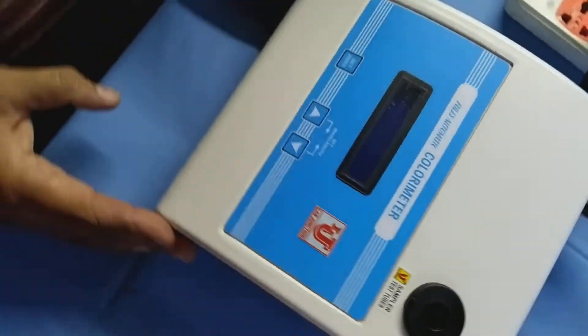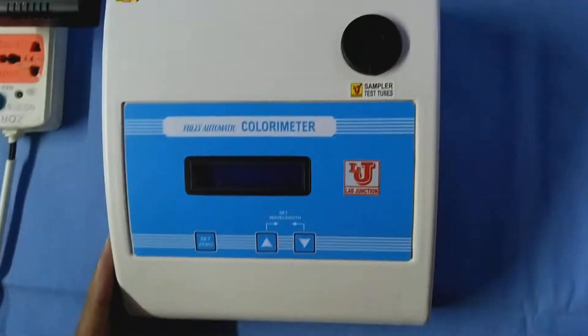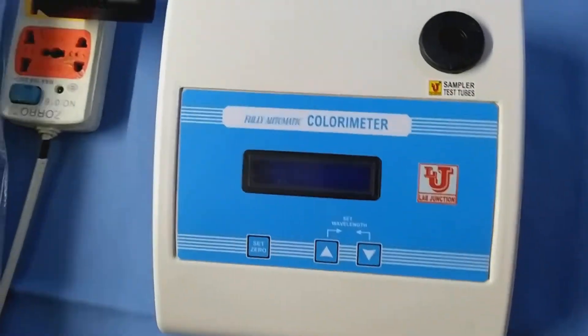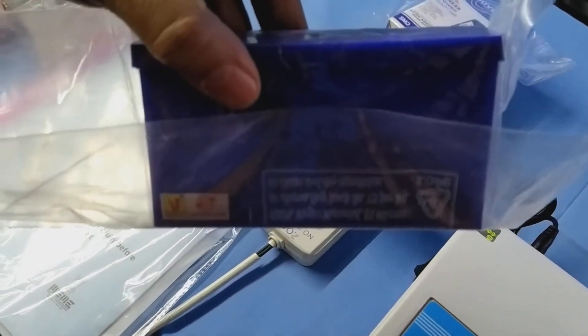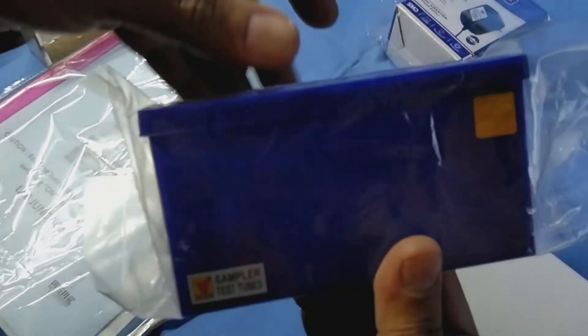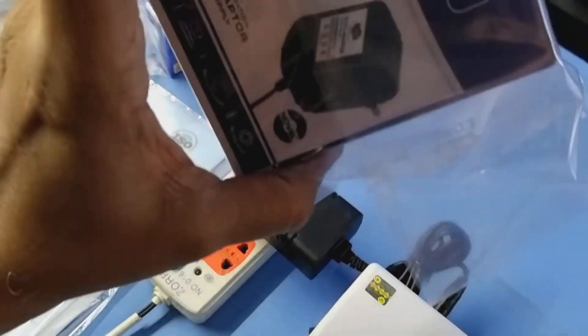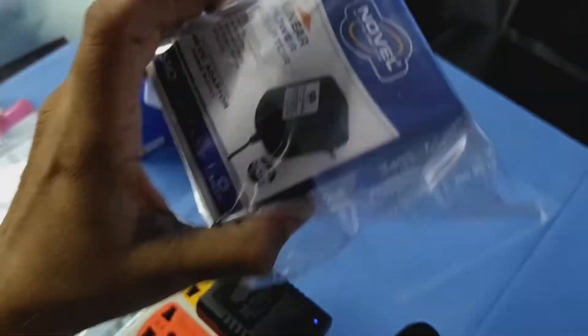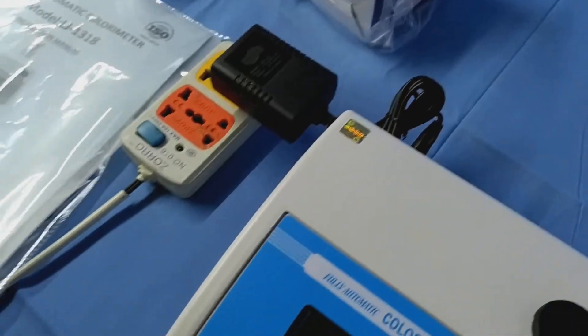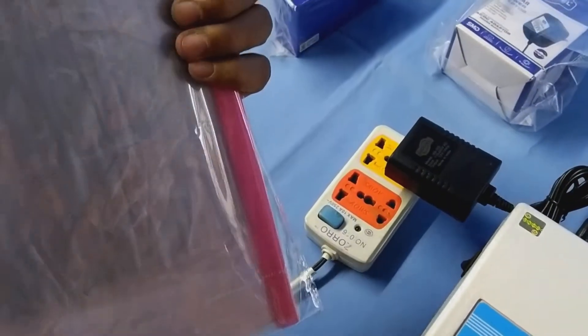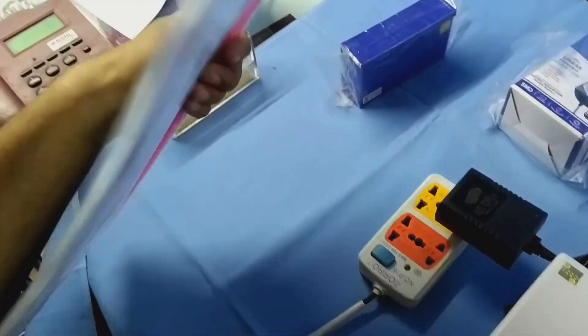With this colorimeter, accessories are test tubes 5 numbers with stand, flat bottom, 12 volt adapter for power supply, instruction manual, warranty card, dust cover.